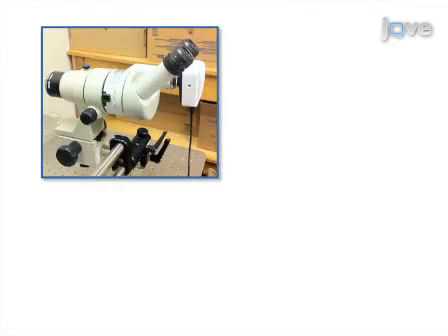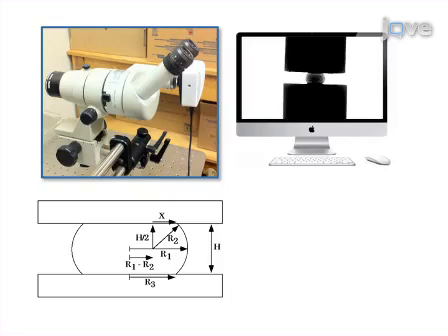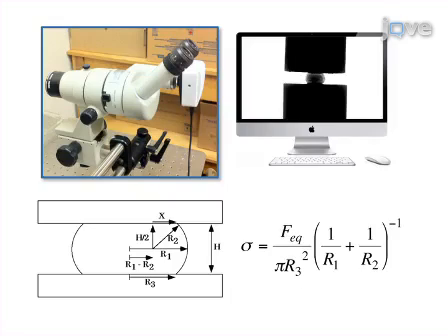The final steps of the procedure are to capture images, measure aggregate geometry and force of resistance, and to input these measurements into the Young-Laplace equation. Ultimately, results can be obtained that show changes in tissue cohesion and how these can influence tumor dispersal or spatial positioning between different cell populations through aggregate spreading assays or cell sorting assays respectively.